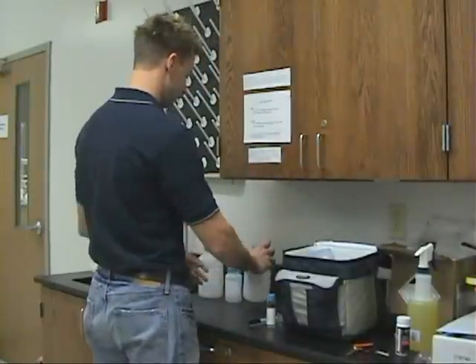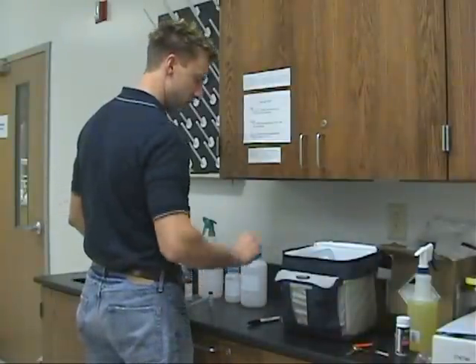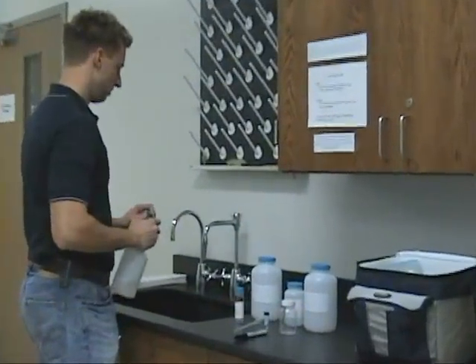Choose a non-leaking tap that has separate hot and cold handles. Swivel faucets, hoses, and drinking fountains are not recommended. Remove the aerator or screen from the faucet before sampling.